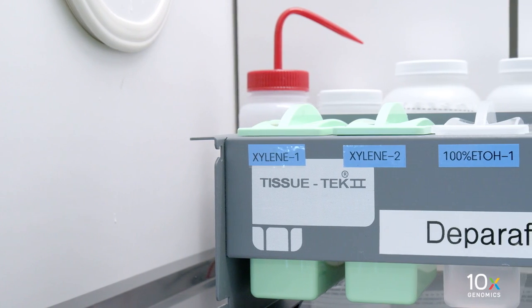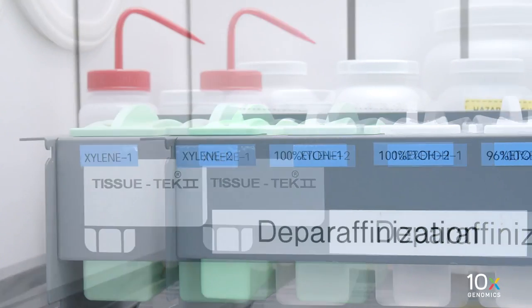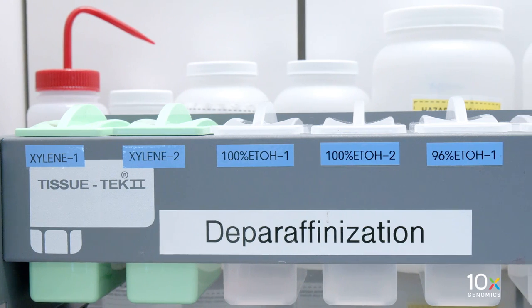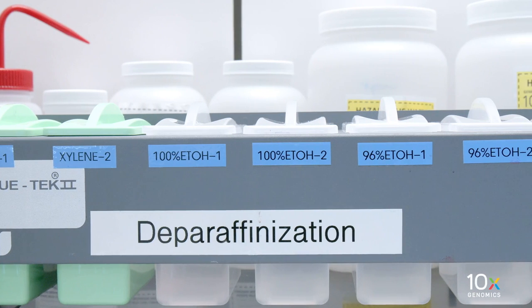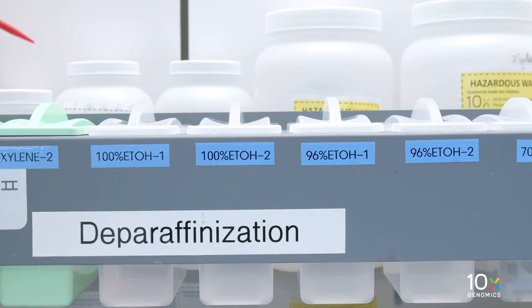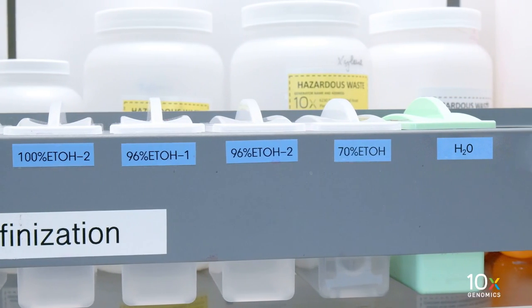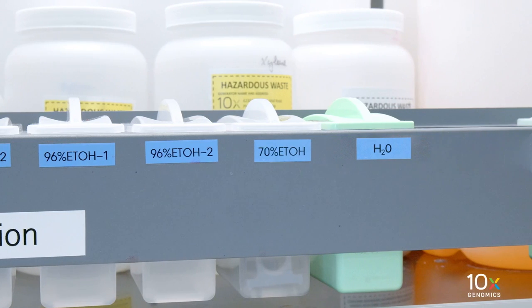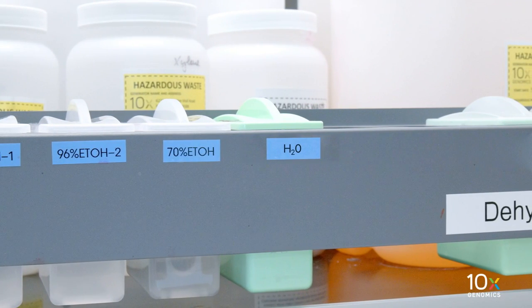Dispense 30 milliliters of xylene into staining dishes labeled xylene 1 and 2. Dispense 30 milliliters of 100% ethanol into staining dishes labeled 100% ethanol 1 and 2. Dispense 30 milliliters of 96% ethanol into staining dishes labeled 96% ethanol 1 and 2. Dispense 30 milliliters of 70% ethanol into a staining dish labeled 70% ethanol. Dispense 30 milliliters of MilliQ or Ultra-Pure water into a staining dish labeled water.